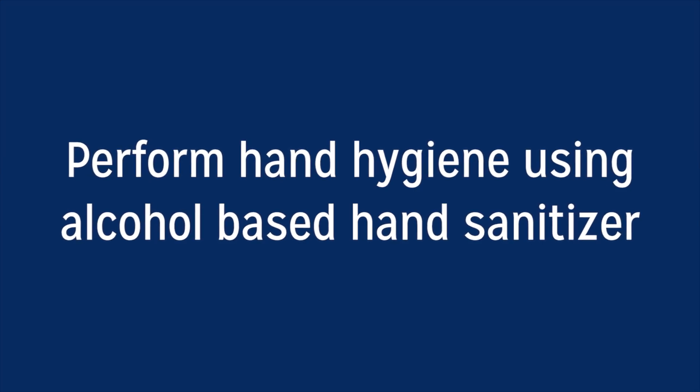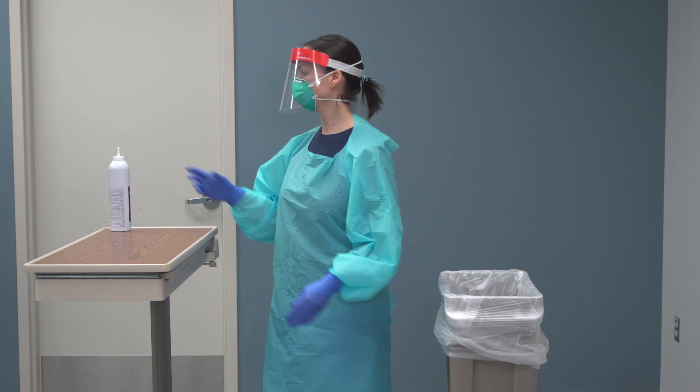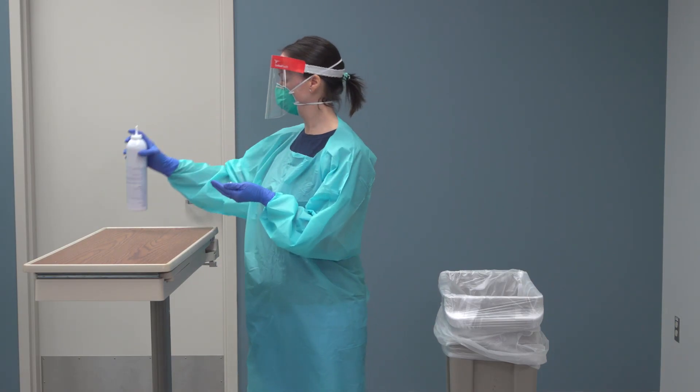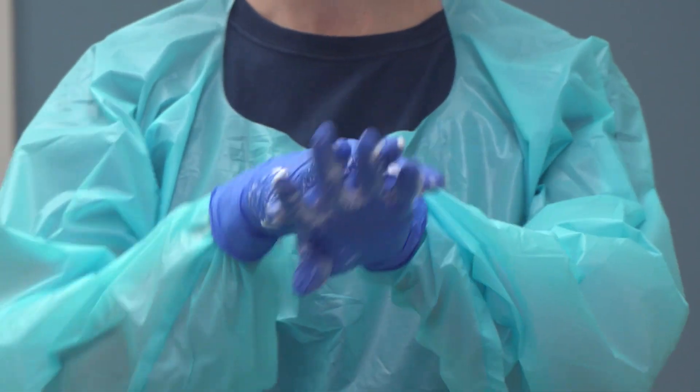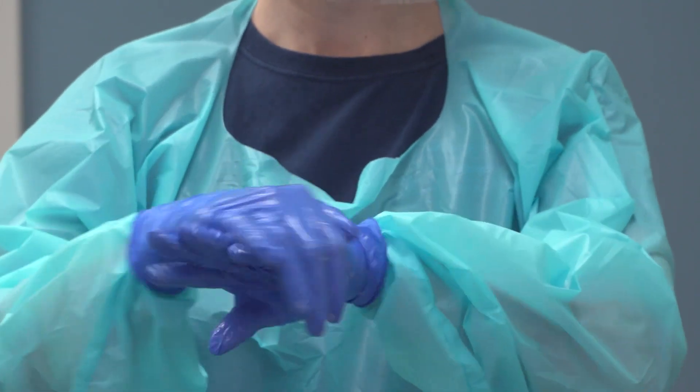When the health care provider is ready to exit the room and begin the doffing process, perform hand hygiene using alcohol-based hand sanitizer. Allow to dry prior to next step.